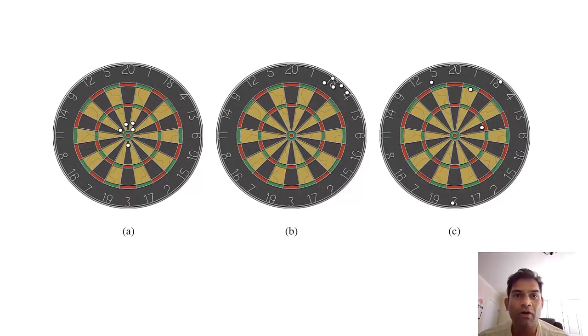In this video, we will go over the difference between accuracy and precision. This becomes very important when you go over the first lab where you pipette water. So you pipette water in the hopes of getting 10 milliliters, and you're going to use three different instruments: a glass beaker, a graduated cylinder, and a glass pipette, which is technically the most accurate way of dispensing 10 milliliters.